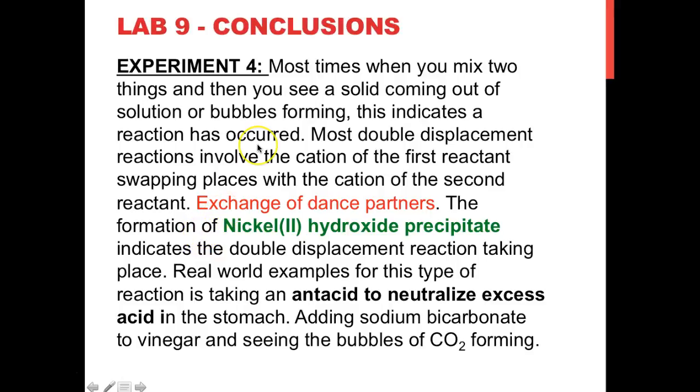So in experiment 4, most times when you mix 2 solutions, you might or might not see, but a lot of the times you do see a solid coming out of solutions, or you see bubbles forming, which indicates the formation of gas.